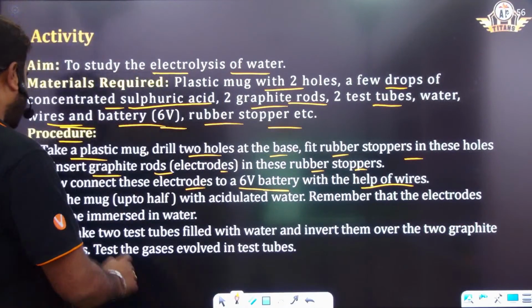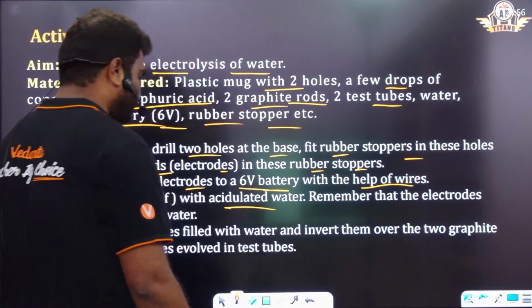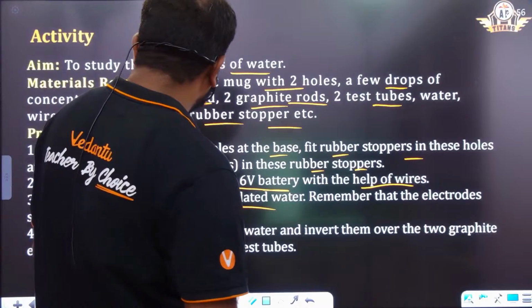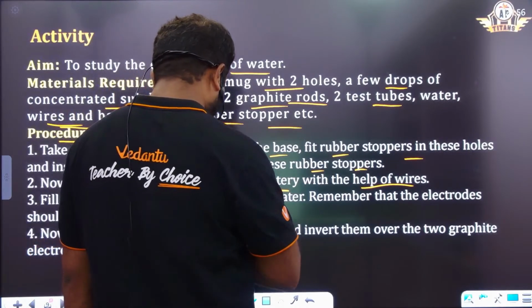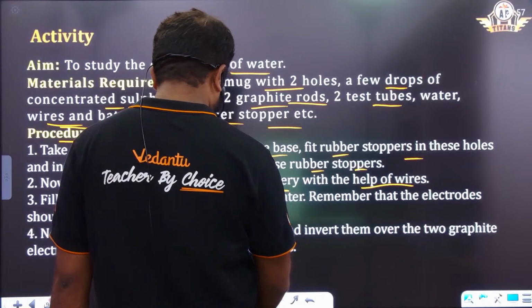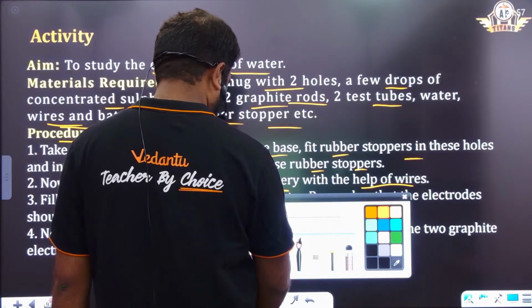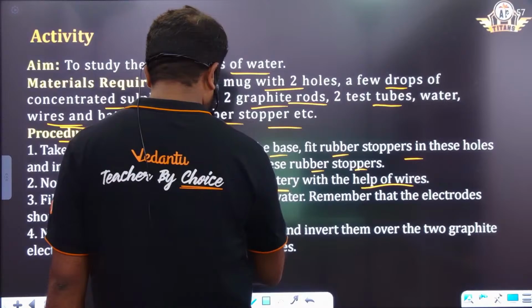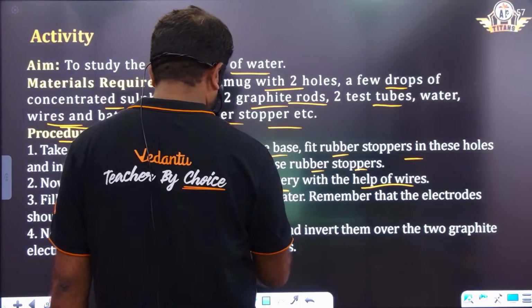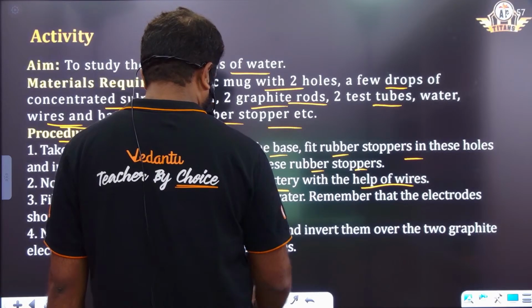Okay, so fill the mug up to half with acid. Here it is dilute acid, actually we should take acidified water.